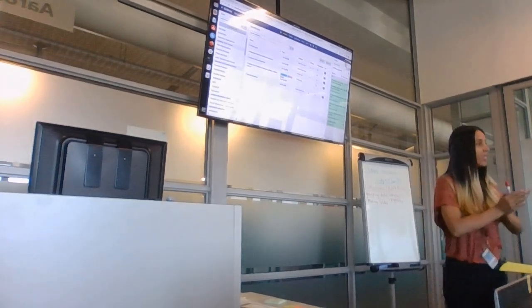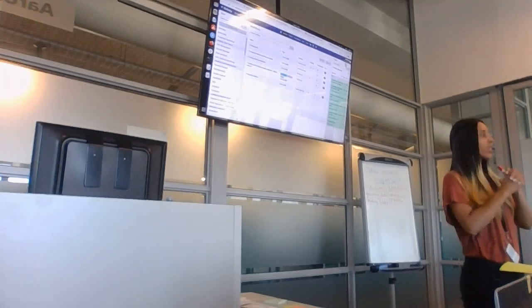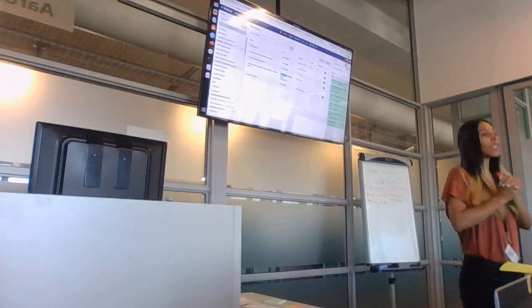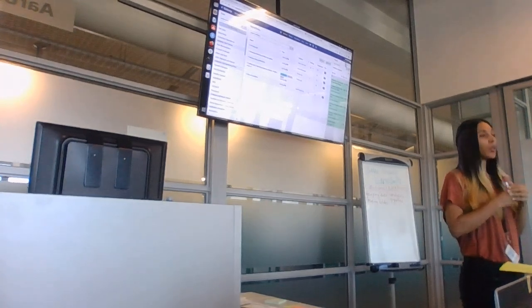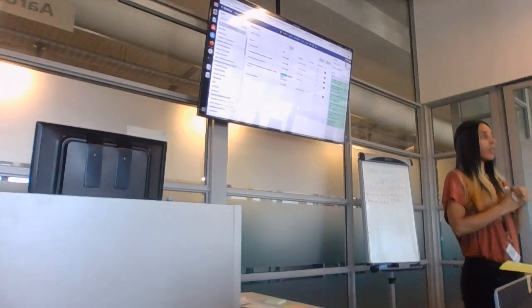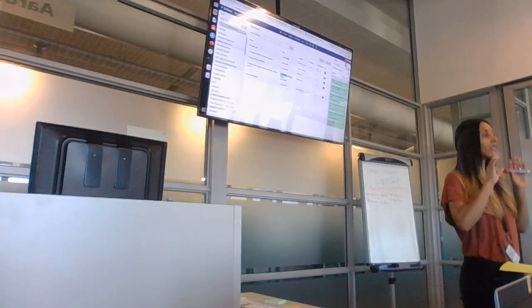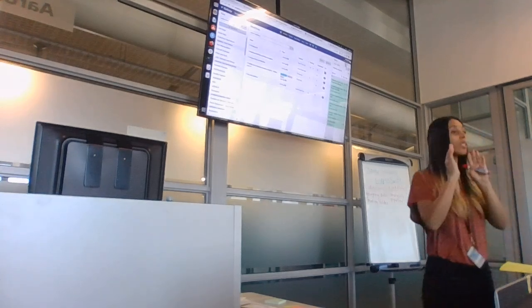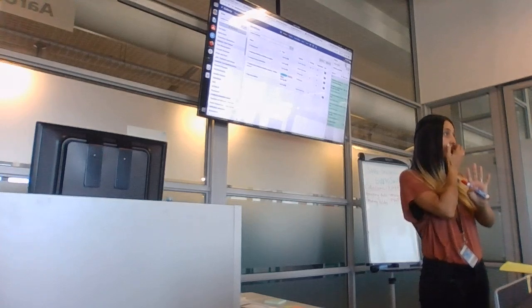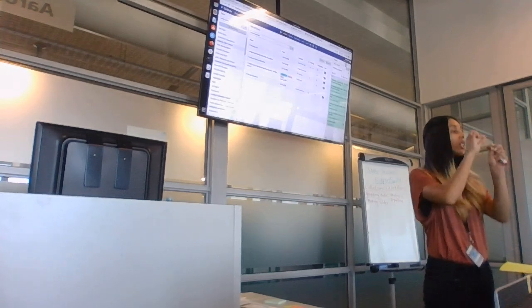We then said, okay, but why is this file different, or these 2 files different? And is there another tool that we can use to figure out whether there was contamination? And then the only thing we did there was, I said, instead of running this tool inside this history that we're in, let's make a new history and call it Kraken, and then drag the file that we want to check for contamination into that new history.